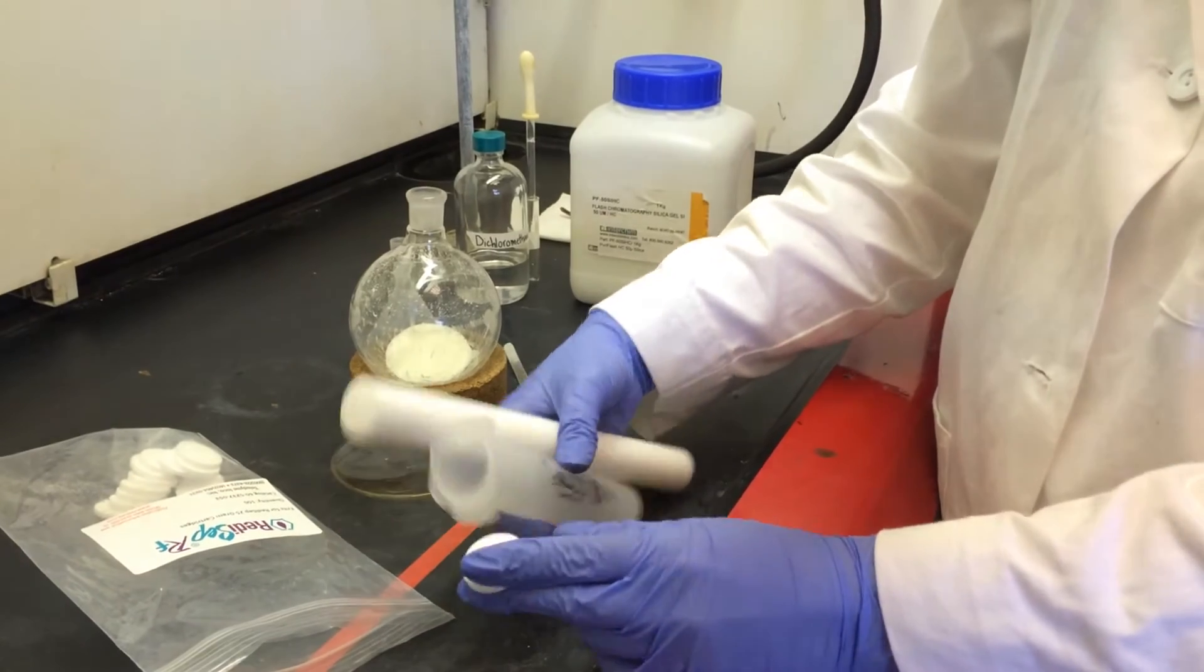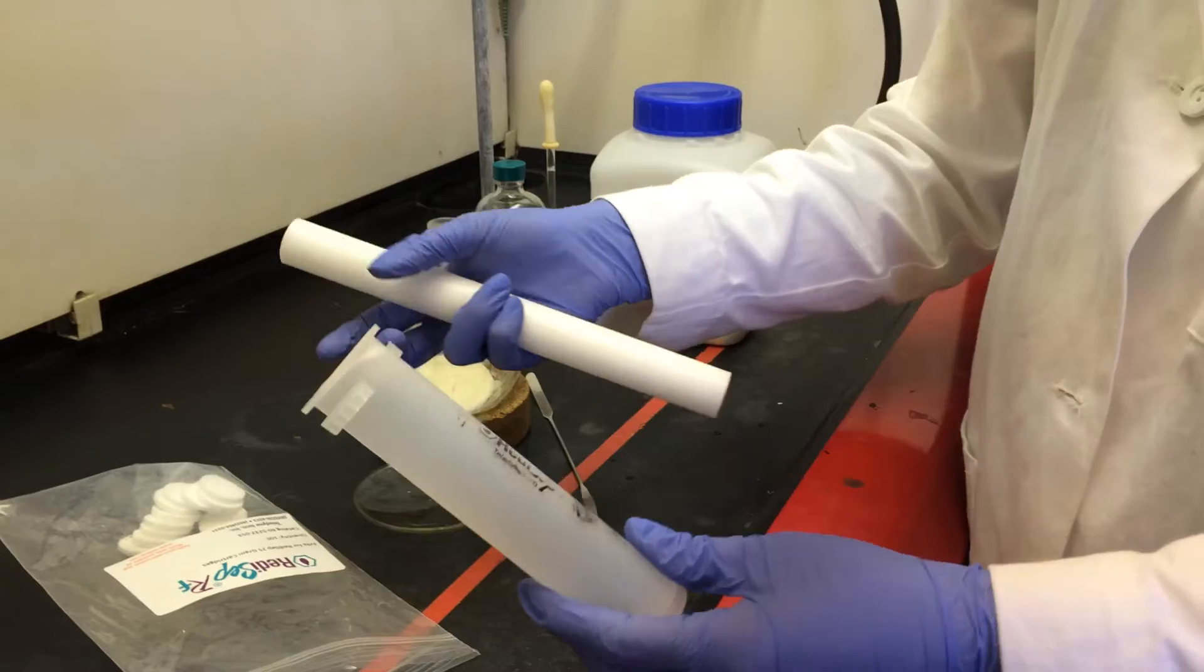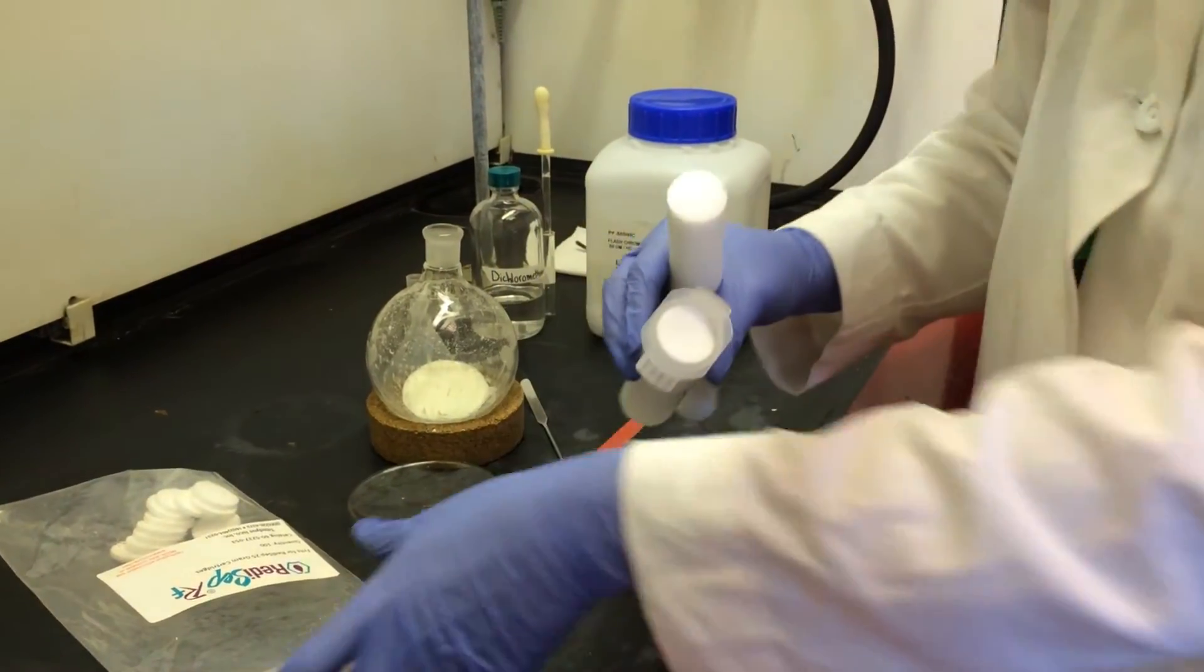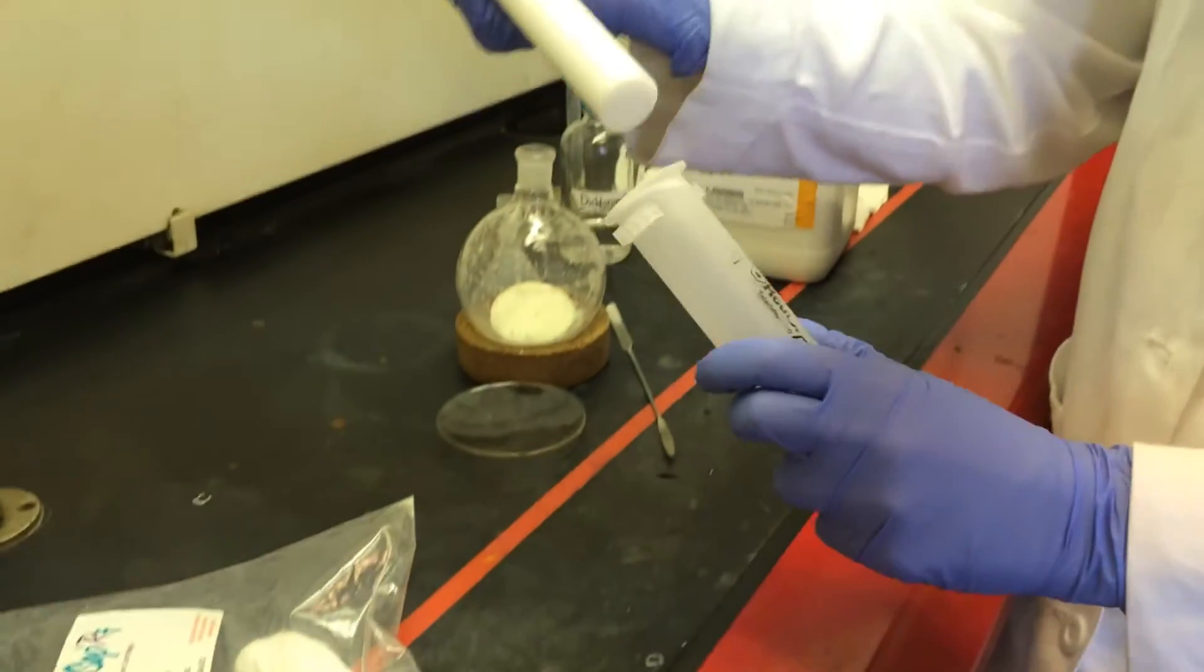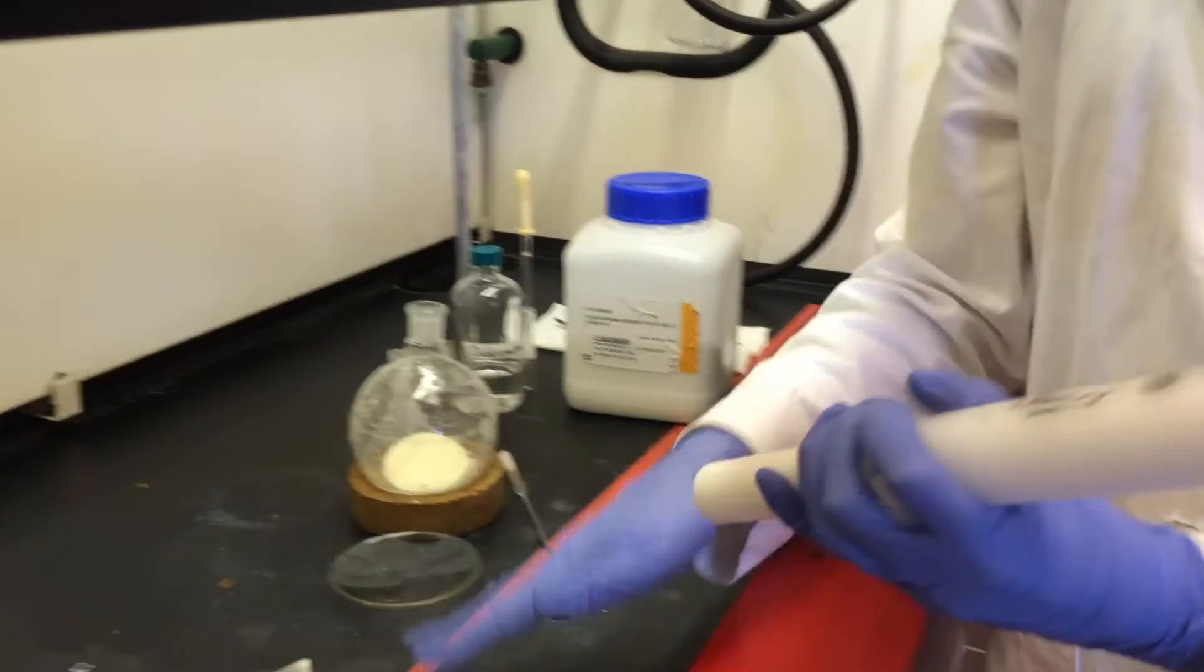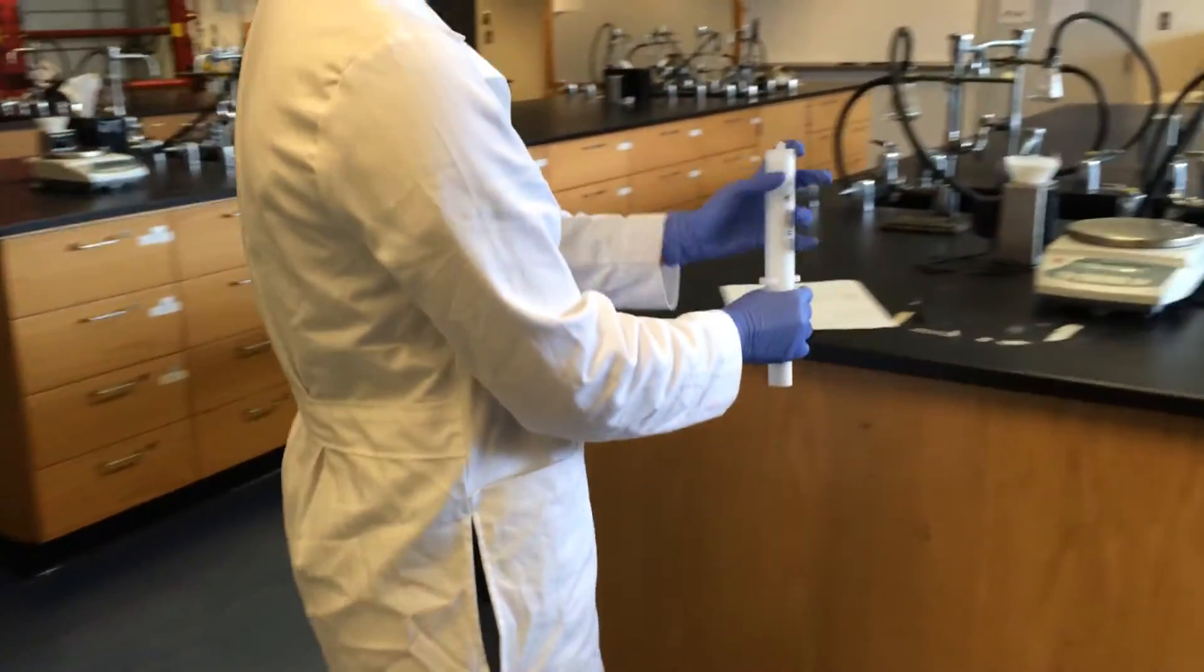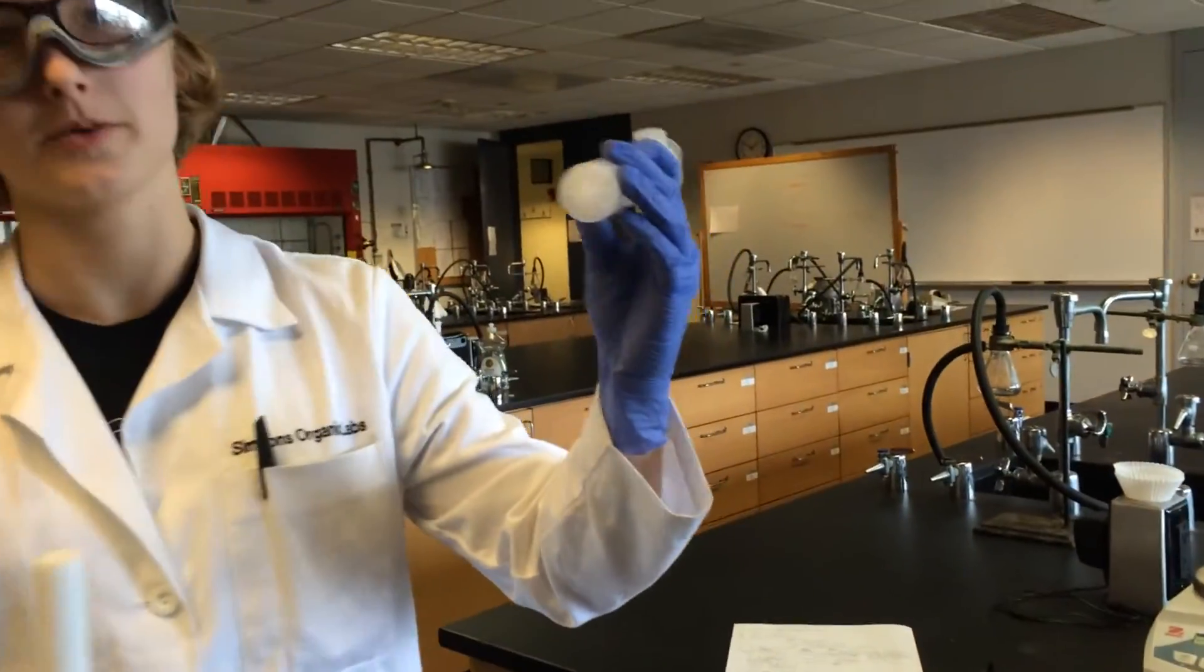Now that your sample is all set, we can begin prepping the cartridge. So first, you want to put in one of these little pieces called a frit before you do anything else. Then you use a PVC pipe, bang it not in the hood, on one of the countertops to get it to stick to the bottom.